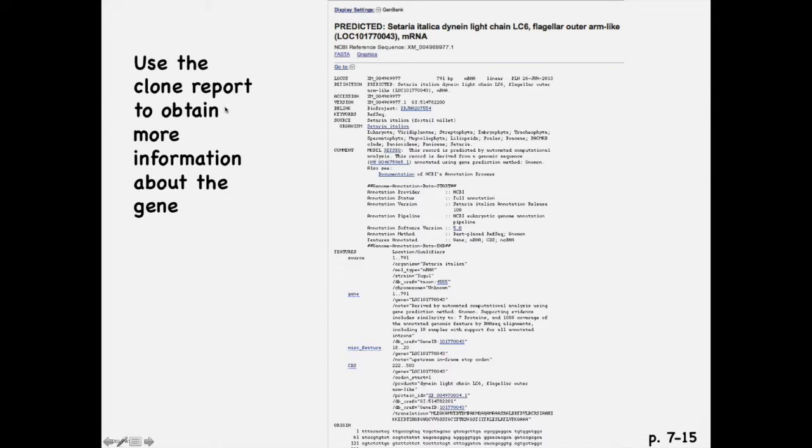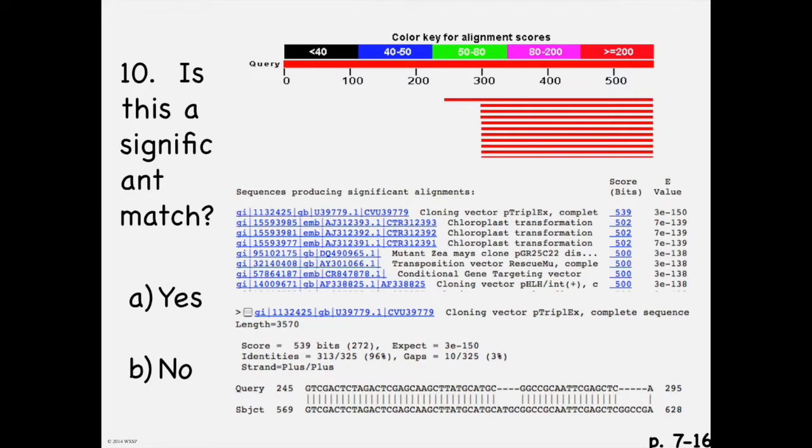And actually the DSAP form will give you an error if you put 3 of the same organisms. So on the clone report form, you can obtain some of the information. When you click on the selection, it's going to bring you to a page on the clone report form for that clone. So if you take a look, the definition is there, the accession number that you selected from the list before. Then you'll have information on the organism and which organism it is. And sometimes it gives you the common name. But the E-value and all the other data, the alignments, the query start and query end are in this alignment here. So you click on here and it'll bring you down to this section.